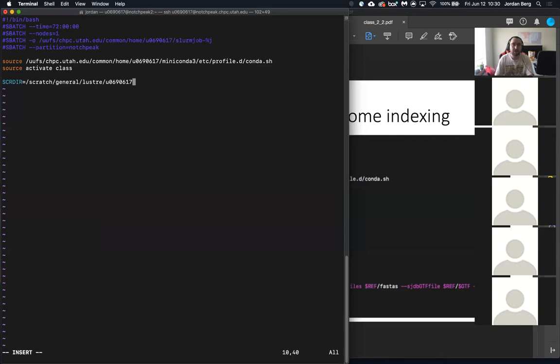And we can also, to keep things consistent, use the SLURM job ID if we're processing data. But since we're going to be creating a static directory that will house this genome build, I guess I'll just keep the Scratch directory as is right there. But we'll add a couple more where we're going to say genome index. We'll call that yeast index.